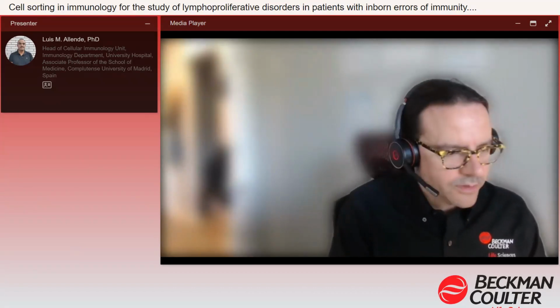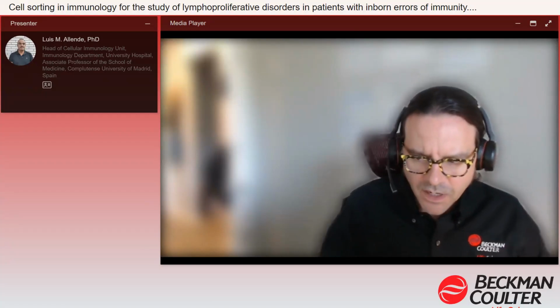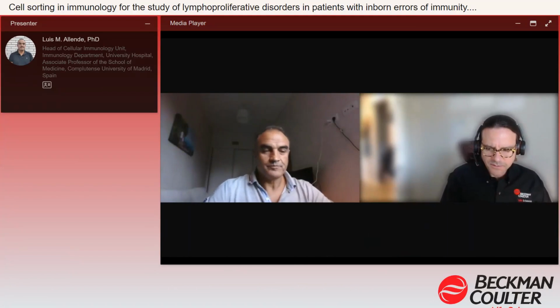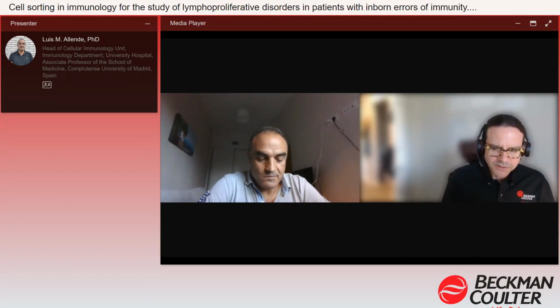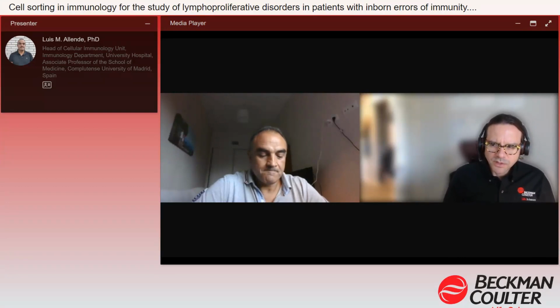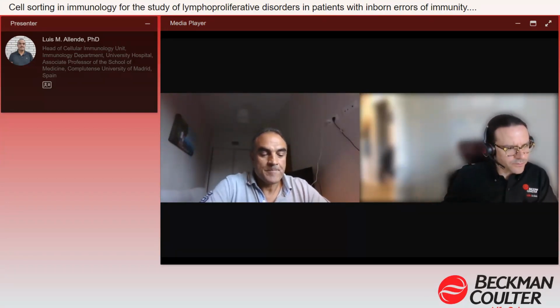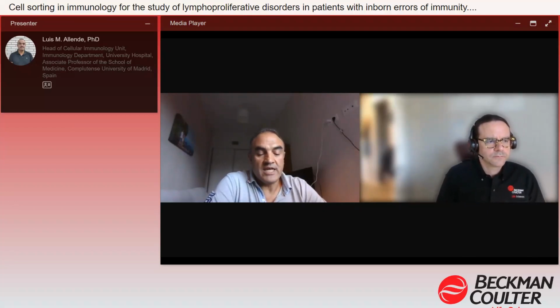Okay. Great. Thank you very much for that, Dr. Allende. Very much appreciate your time to present this to us. I did have a few questions that had come in. I'd like to ask you if that's all right. Okay, I'm ready. I noticed you got some pretty pure populations at the end there in your sorts. I wonder, do you have a feeling for how many cells you need and what purity you need to support your further molecular assays? Okay, in our experience, my team has sorted more than 200 human samples.